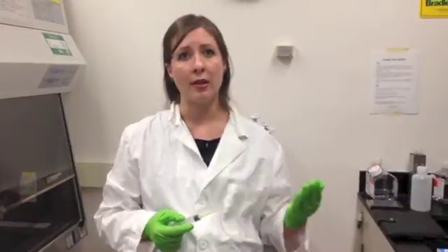So when you're working with sharps, there are several things to keep in mind. First of all, you need to remember that the glove is not a barrier for needles. The needle will go right through the glove, so you can't really consider that your first line of protection.